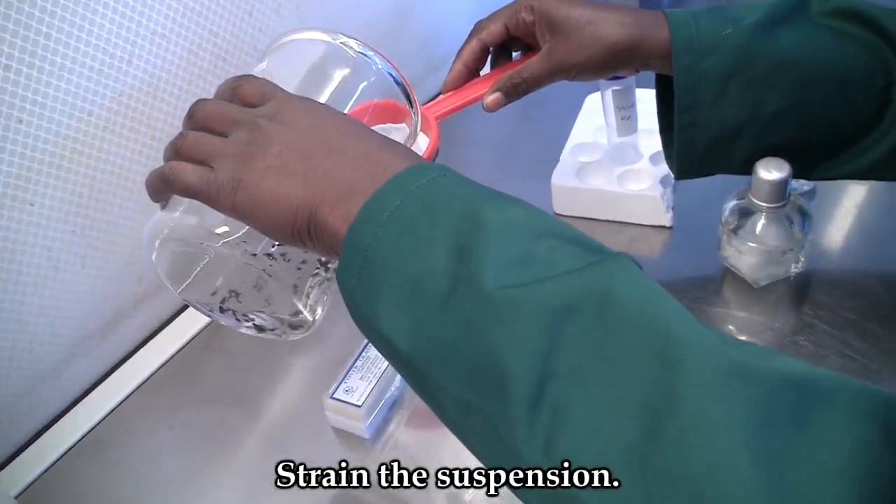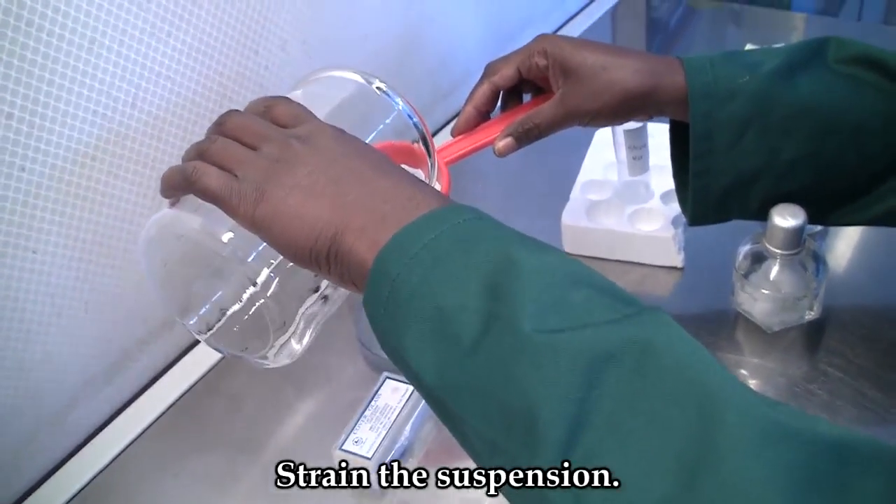The spore suspension will need to be sieved. For this, you will need a strainer.